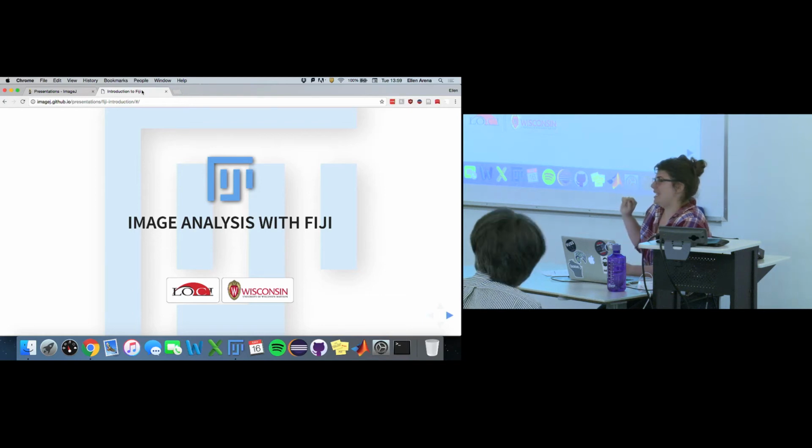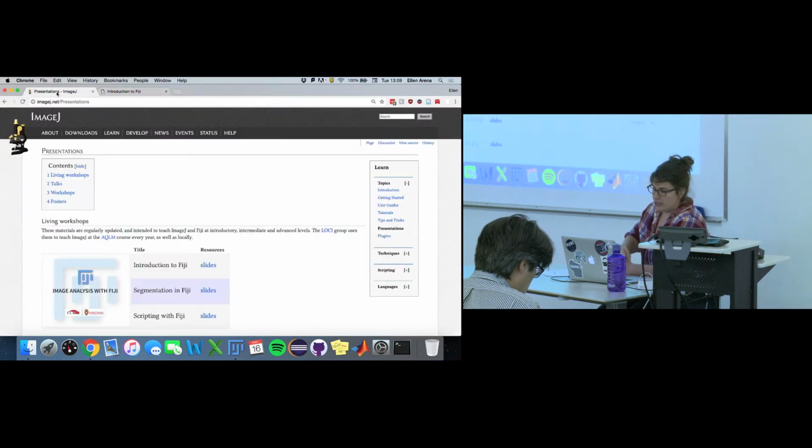For those of you walking in, grab a seat, pull up a chair, get comfy, and open Fiji on your systems if you want to follow along with the slides. The link is imagej.net/presentations with a capital P. We'll start with the introduction to Fiji slides. Again, if you have questions or need help, just raise your hand. Either I can help you verbally, or Allison is in the back of the room walking around to make sure everyone's doing okay.